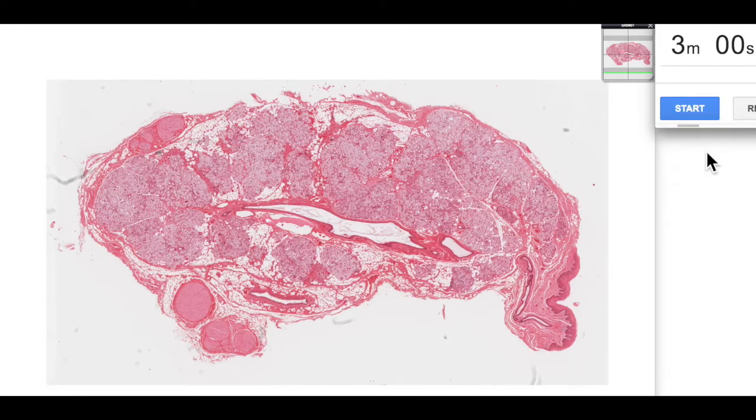Hi and welcome to another episode of 3 Minute Histology with Jamie Chapman. Today we're going to be looking at a section of the sublingual salivary gland.